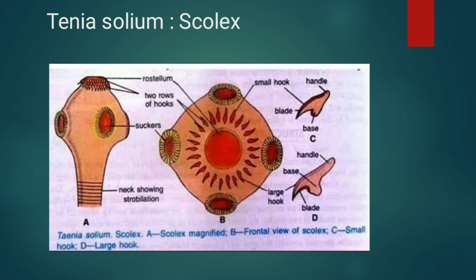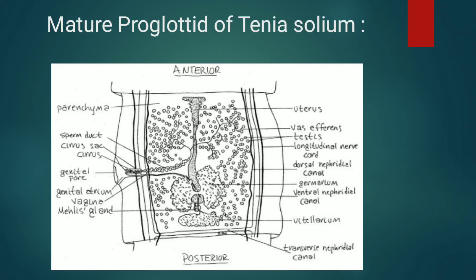The scolex lies buried in the intestinal mucosa of the host intestine and destroys host tissue. Now we see the mature proglottid of Taenia solium. Each mature proglottid is square in shape. The lateral sides contain lateral longitudinal nerve cords and lateral excretory canals. A set of male and female reproductive organs is present in each mature proglottid. The female genital system consists of ovarian lobes, oviduct, ootype, vagina, uterus, and vitelline gland.